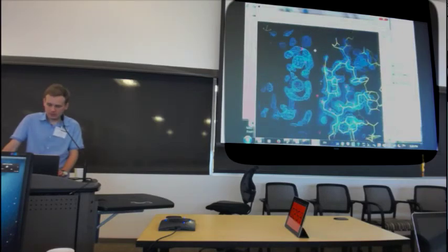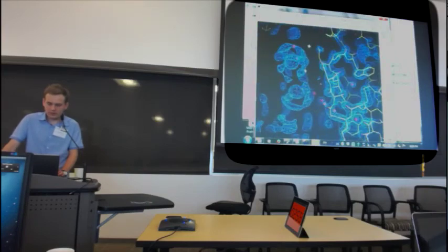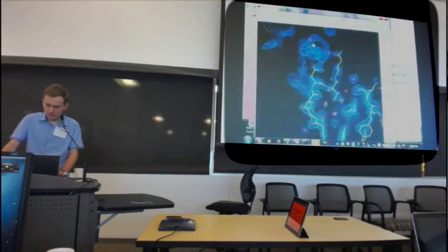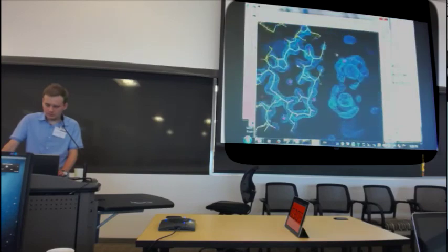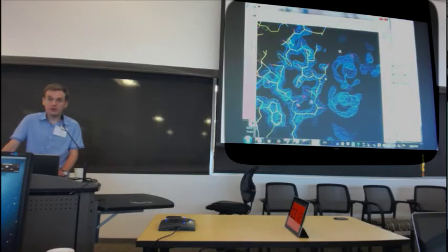And now we want to look at this. You see that the gadolinium sites in these complexes are coming back. And the map looks quite okay. It also puts some waters on them. And it requires only a little manual refinement.